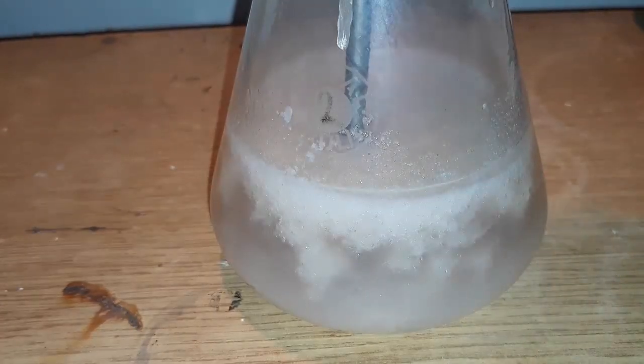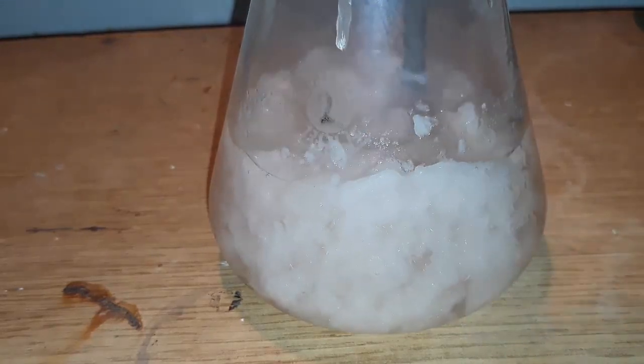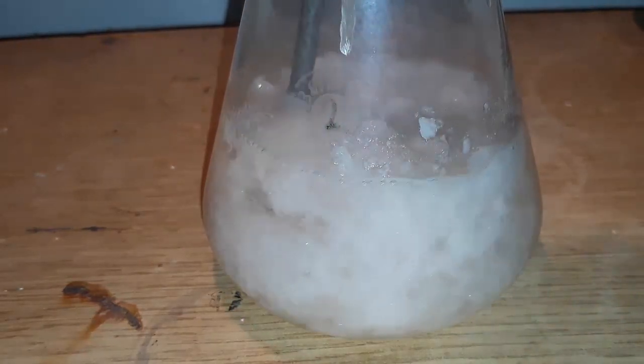After adding most of the HCl and waiting a couple of minutes, we get a thick precipitate. It looks pretty much like feta cheese.